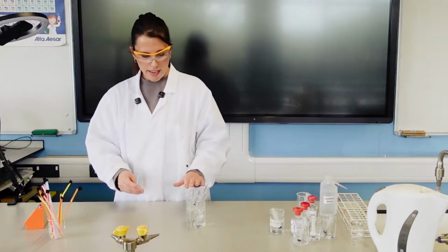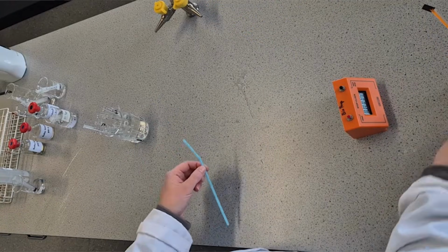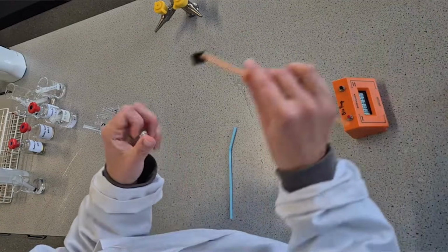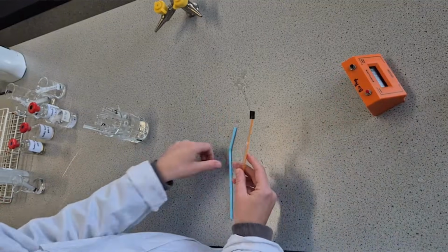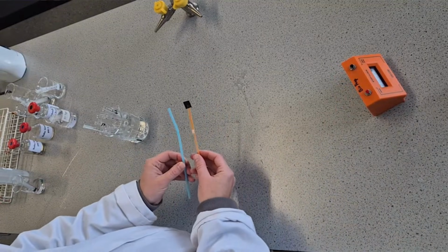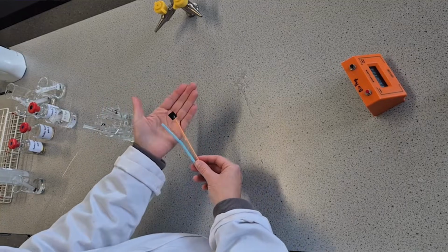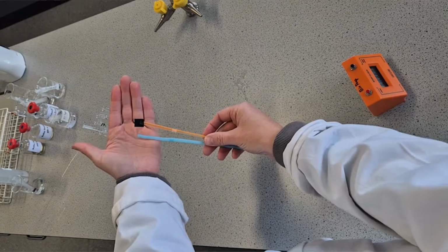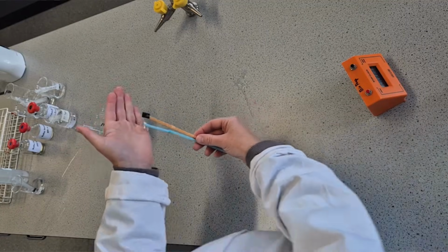Now, while that is acclimatizing, one other key thing just to be aware of in general, in terms of techniques and anything linked to experiments, that color change is the endpoint, which it is in this one. The endpoint of this experiment is when this piece of film goes colorless, and you might not even be able to see it. I'm not sure how well you can actually see it, but that is just a clear and colorless piece of photographic film.